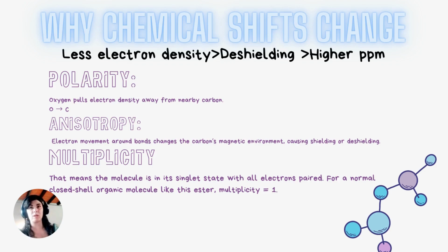So this just describes the characteristics of the chemical shifts and the way that oxygen pulls the electron density away from the nearby carbons. The magnetic environments causing shielding and deshielding are the main concept in which we can then take these numbers and start to draw them.